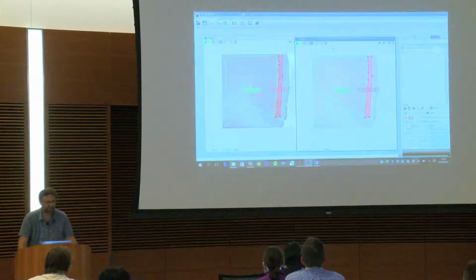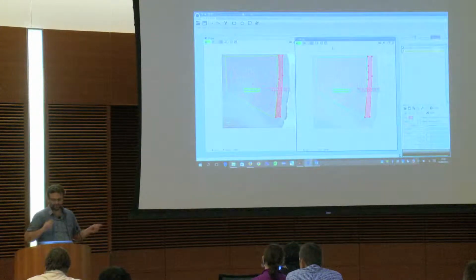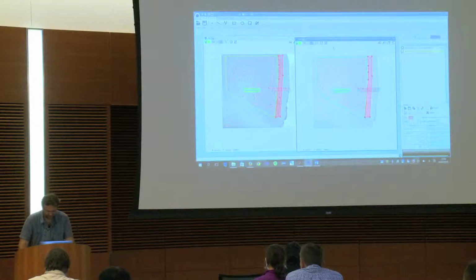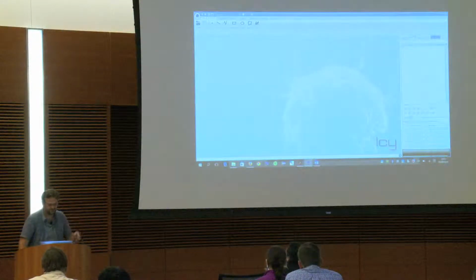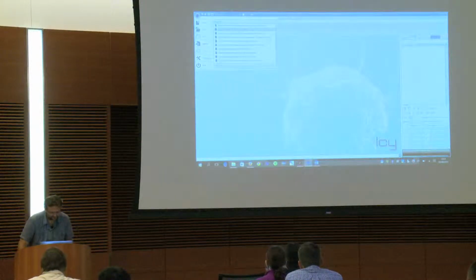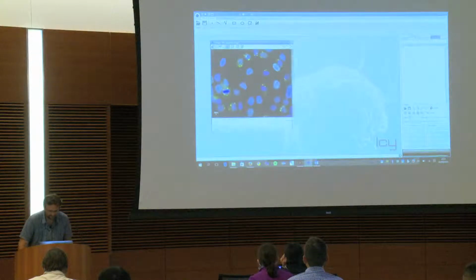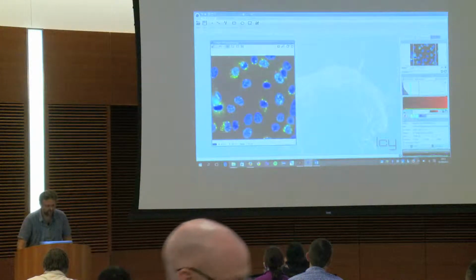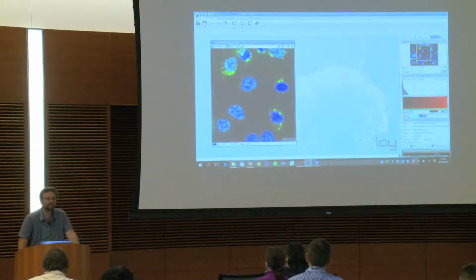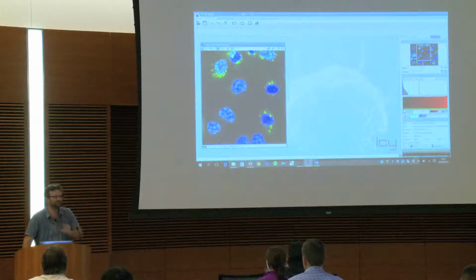Okay. So now I will show you what has been shown this morning. It was the second talk, I guess. And it's very interesting because to us, it brought a question some time ago. So if I take this image that looks like the one that we had this morning, the question that we had was how to be able to count the green spots within the blue cells and make it fast. So this morning you saw all the different steps to do this.